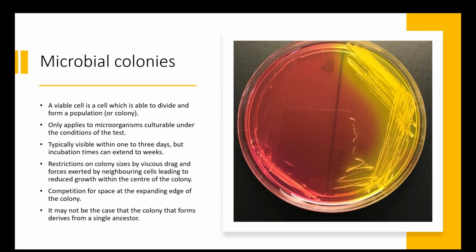But the important thing about a colony is the actual word colony, which connects to clonal. With all of the organisms, the organism that forms the colony, if it's not mixed, is theoretically descending from a single ancestor, and all of the cells will be genetically identical, except for any mutations that might occur. Mutations will always start at a relatively low frequency. So that's colony in general.